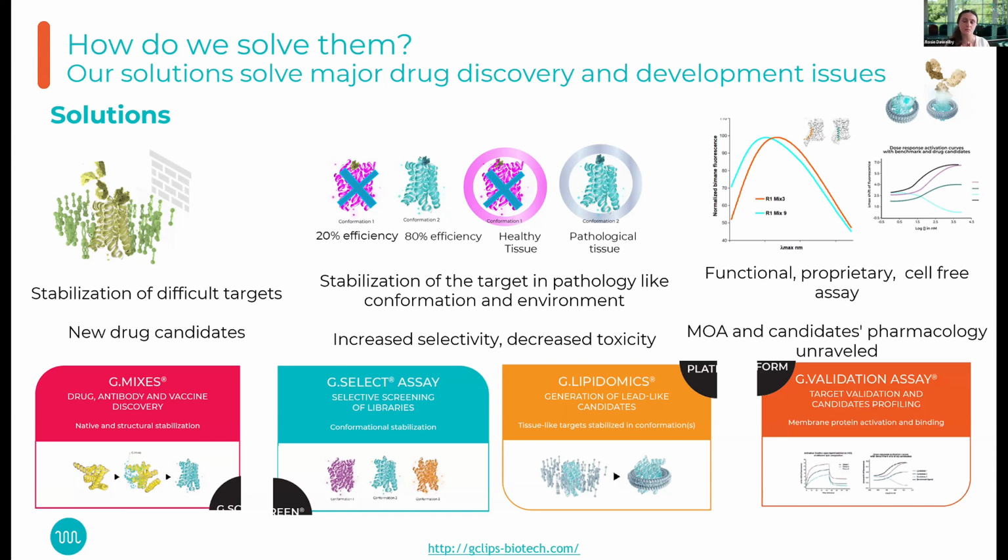And finally, we put together a functional assay, a cell-free, fluorescent-based functional assay that allows us to validate that what we have here, purified and reconstituted, is functional, using benchmark ligands, of course, whenever they exist, but also to do some target validation, target engagement, and most of all, to characterize the candidates and the hits, the binders that we get.